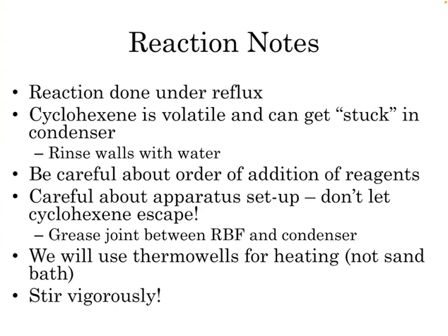All right, just some notes on this reaction. The reaction is done under reflux, so you will want to review that section of the Zubrick lab manual. Cyclohexene is very volatile, so it can get stuck in the condenser, in that middle part of the condenser.